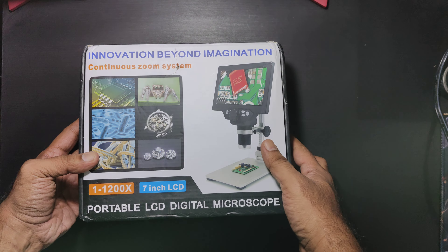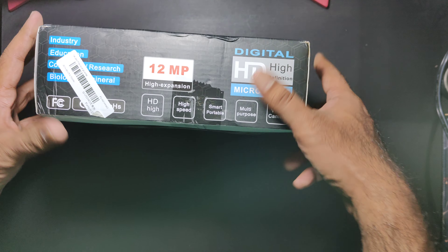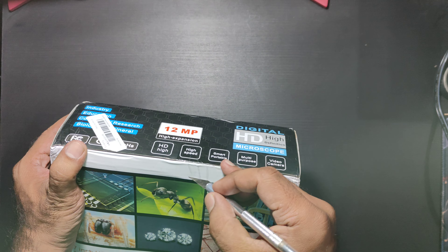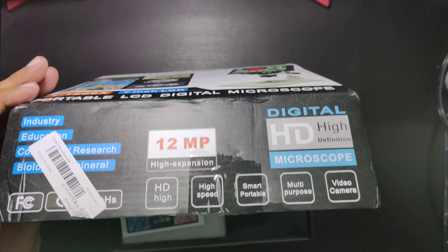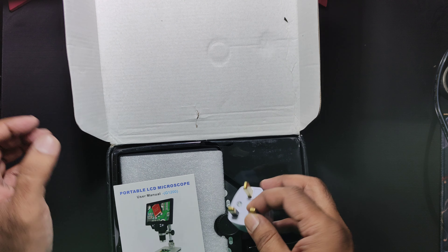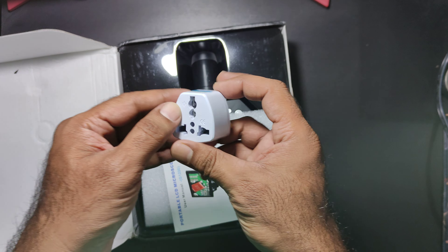Hello guys, welcome to another unboxing. This is a microscope G1200D which I got from Banggood. It was delivered to me without paying any extra customs duty. It was delivered in India by DDDC, so they are the shipping partners it seems.